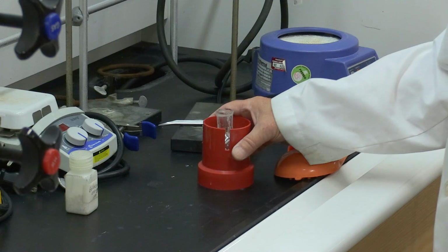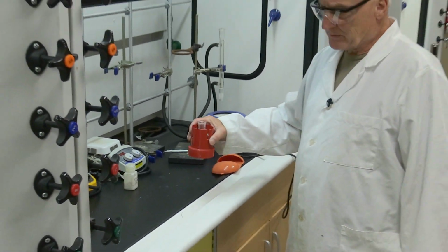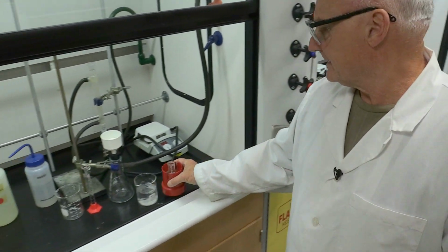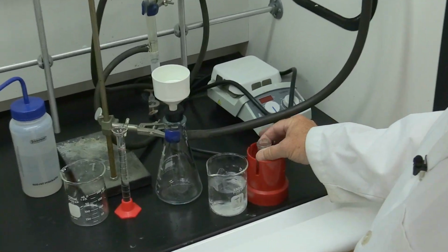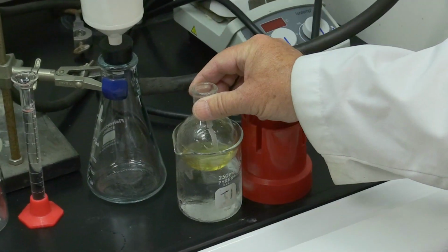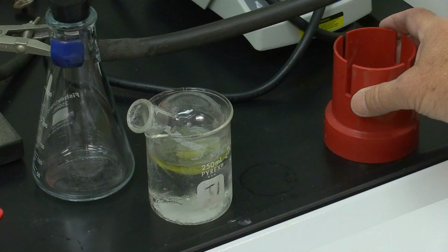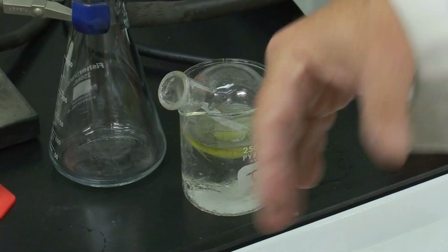Okay, so we've let it cool for a couple of minutes. We're going to bring it over here to the ice bath and let it cool for a little bit longer at a cooler temperature and go through the next couple of steps.